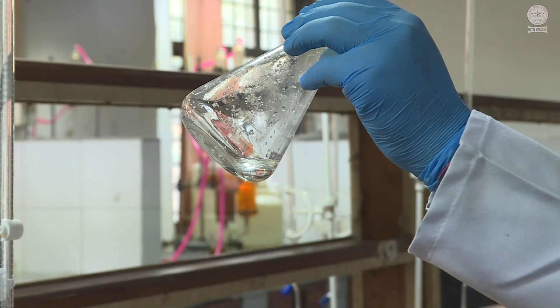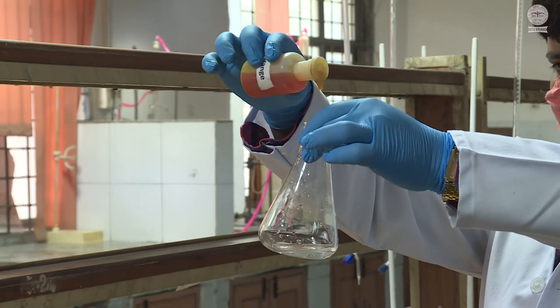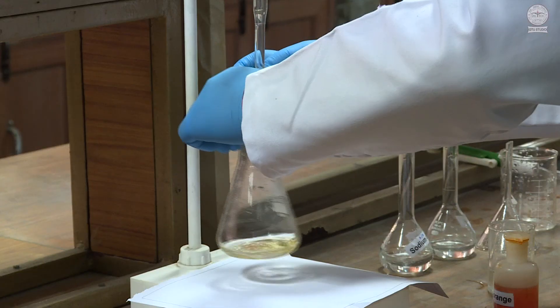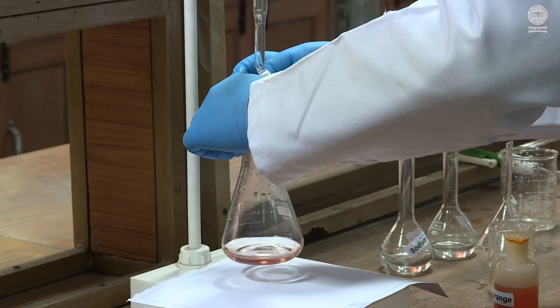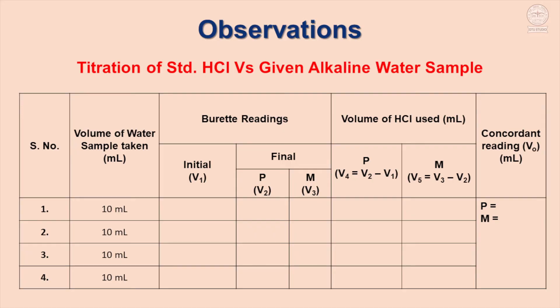The volume reading V2 is noted from the burette after the pink color disappears. After discoloration, one to two drops of methyl orange are added into the same solution. The titration is carried out till the yellow colored solution turns pink. The volume V3 is noted. All readings — V2 and V3 — are recorded in the table, and the experiment is repeated two to three times till concordant readings are obtained. V1 is the initial volume, V2 is the end point for phenolphthalein, and V3 refers to the end point for methyl orange.